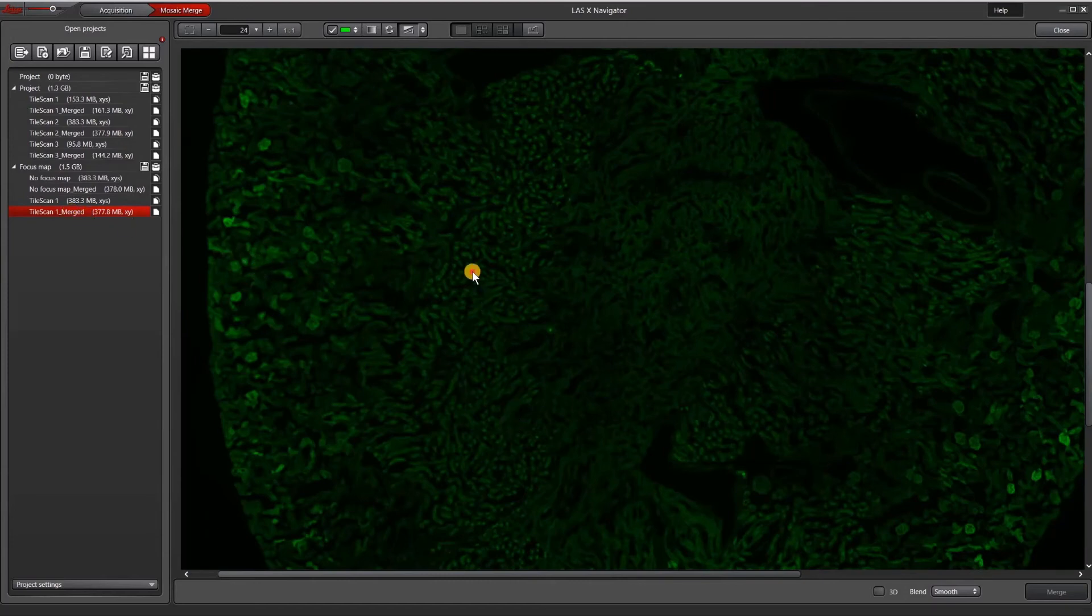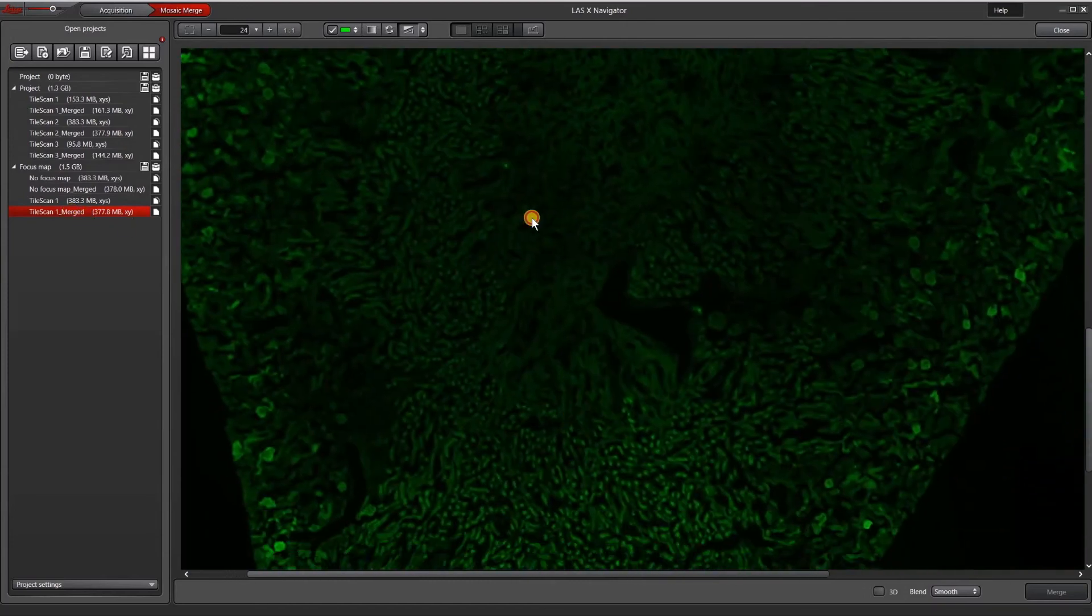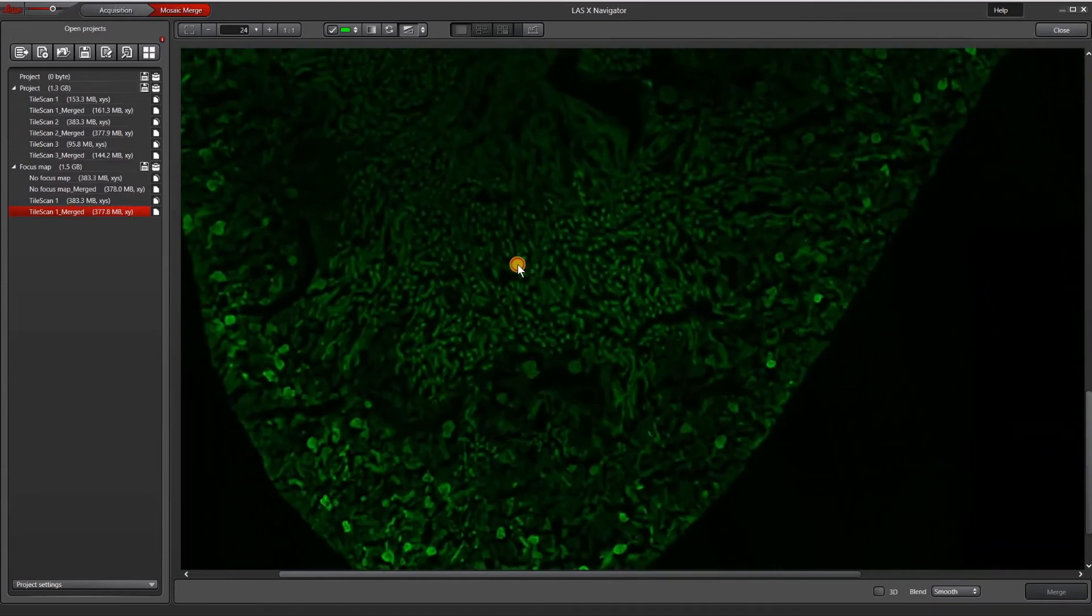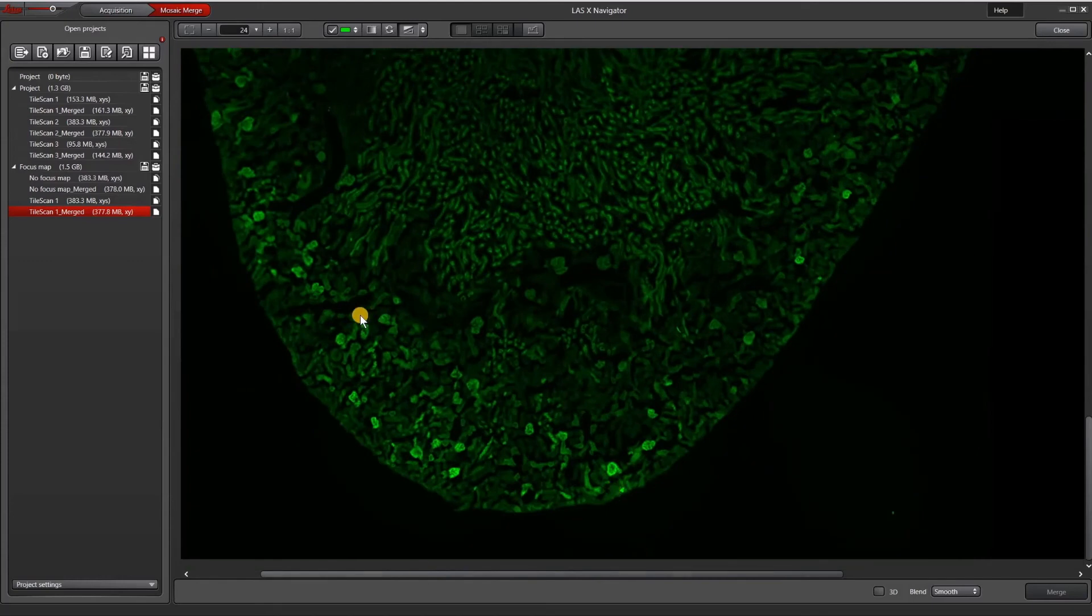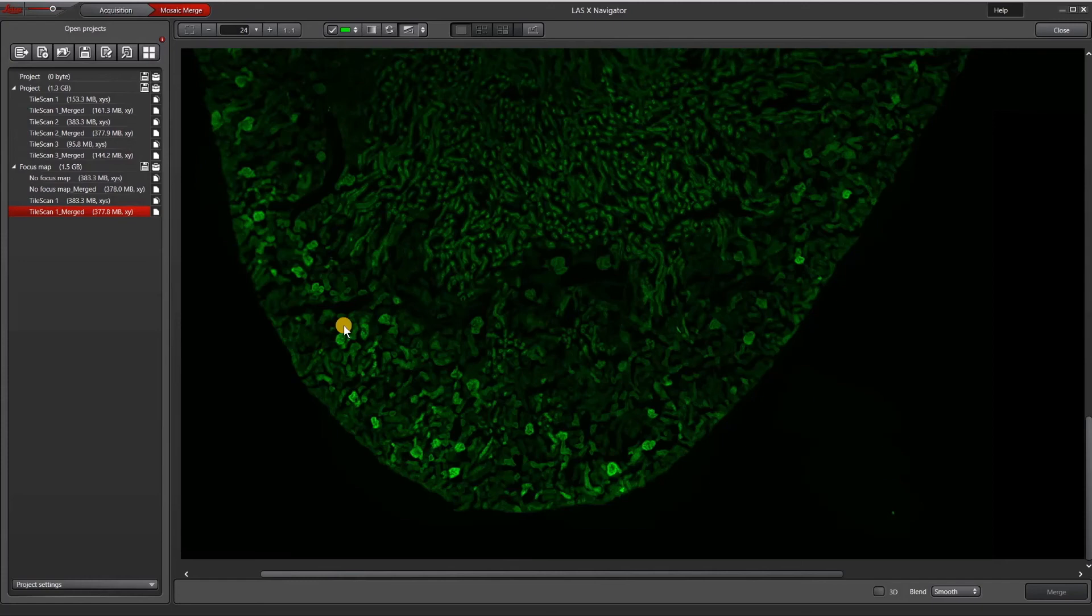You can see that this is much better and our regions down here are completely in focus. This concludes the tutorial on setting up a focus map in LASX Navigator. Focus map is just one of the tools to making sure that you have an in-focus image. Please check out our other videos for tips on how to use autofocus and adaptive focus control for your images.